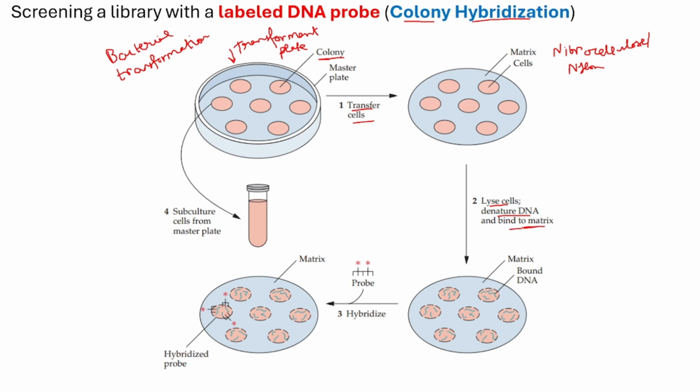So you have to use suitable procedures so that these single stranded DNA molecules get bound to the matrix. We have several procedures such that nucleic acids like DNA get bound to the matrix. If you have read about southern blotting, we used several binding agents so that the DNA gets fixed to the matrix, and formaldehyde fixing is one technique. Likewise, we wash away the unbound DNA.